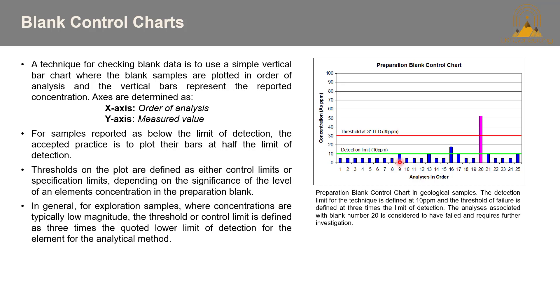Thresholds in a plot are defined as either control limits or specification limits, depending on the significance of the element concentration in the preparation blank. The green line is the detection limit at 10 PPM, and the threshold is three times the lower limit of detection — in this case 30 PPM. It's important to check all elements, with particular attention paid to elements of interest. Everything here is doing fine except for sample number 20 in pink, which is considered a failure and requires further investigation. Remember the lab is your partner.